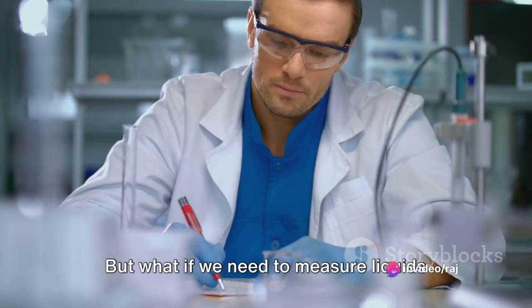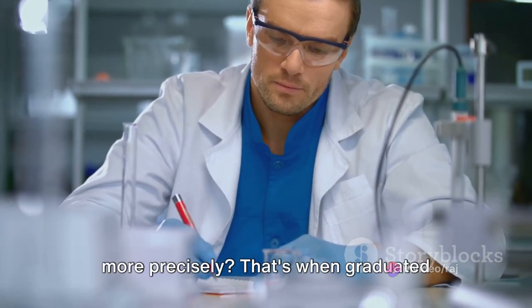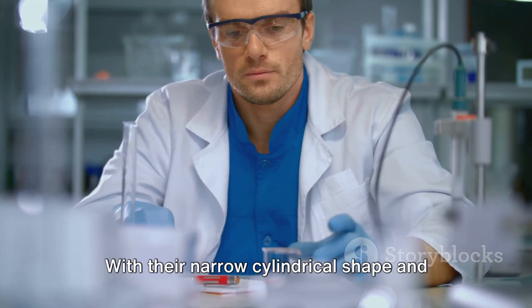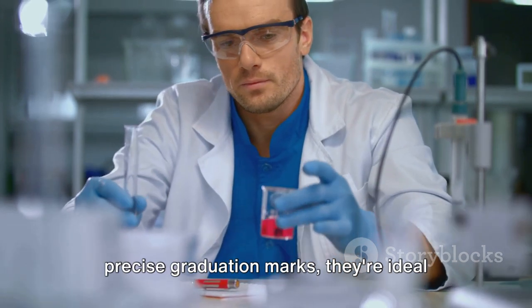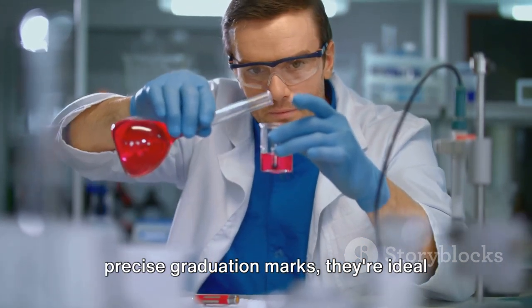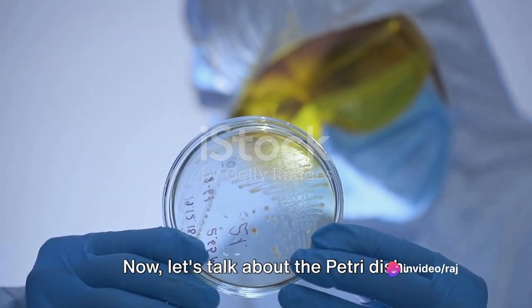But what if we need to measure liquids more precisely? That's when graduated cylinders step in. With their narrow cylindrical shape and precise graduation marks, they're ideal for measuring volumes of liquids accurately.